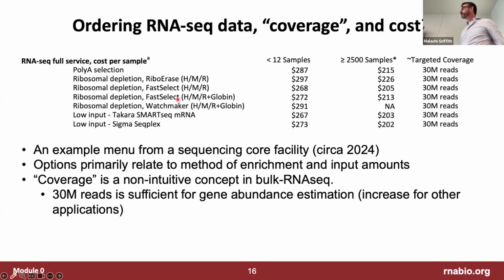Like the flow cells, for example, if you have enough samples to fill 2 or 3 flow cells, should you stack or repeat one sample across all 3 as a read control?